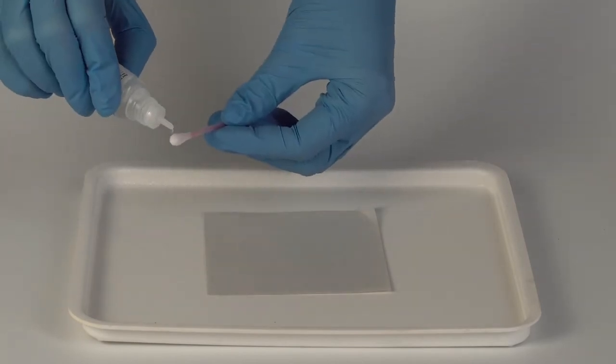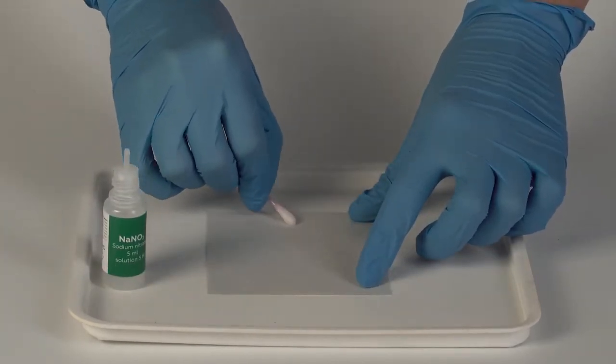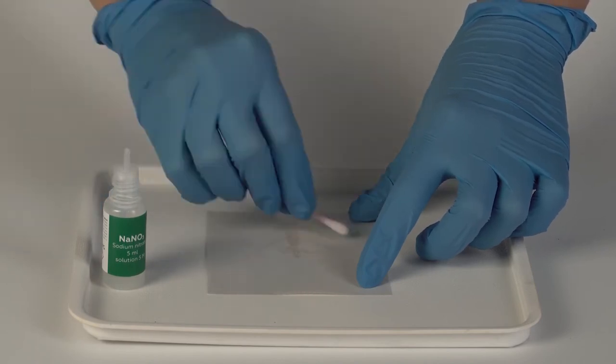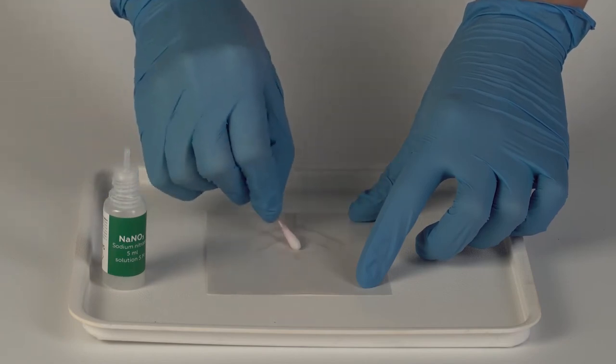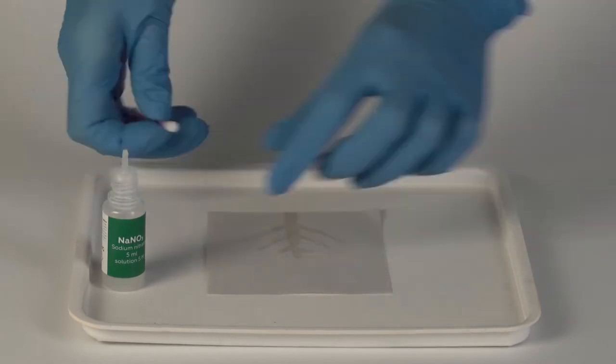Thoroughly wet a cotton swab with the sodium nitrate solution and paint a pattern on the paper. For best results, start painting from the edge of the paper, making a thick continuous line. Make sure the solution thoroughly wets the paper.